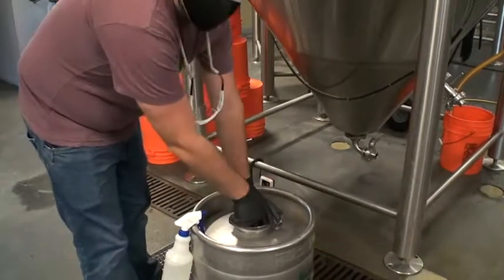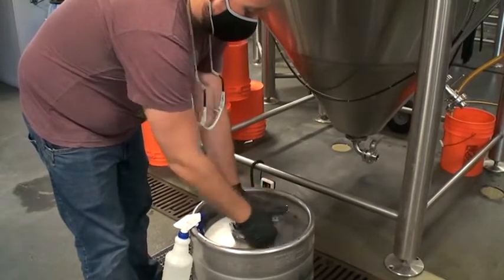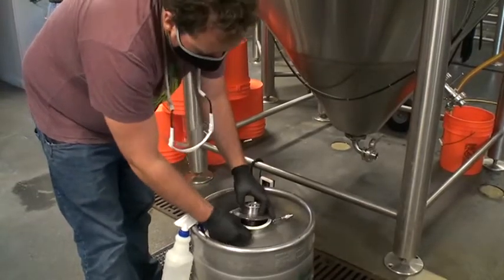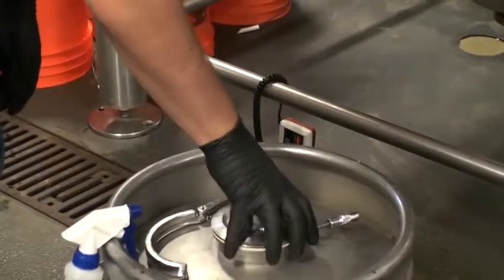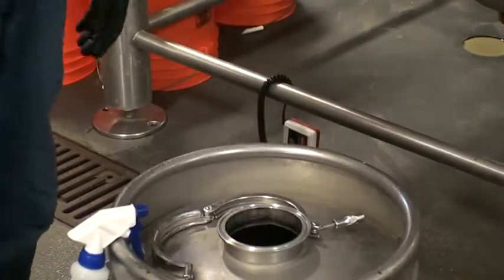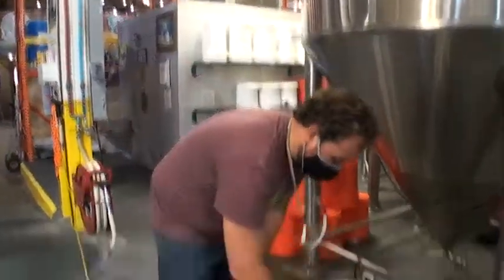Oh, so that's just a regular Sankey, yep. Top on there, with the big tri-clamp that takes the whole top off. That's what makes it unique as a yeast brink. Yes, the whole top lifts right up. Cool. This is the stem I was talking about. It does not quite hit the bottom of the keg.